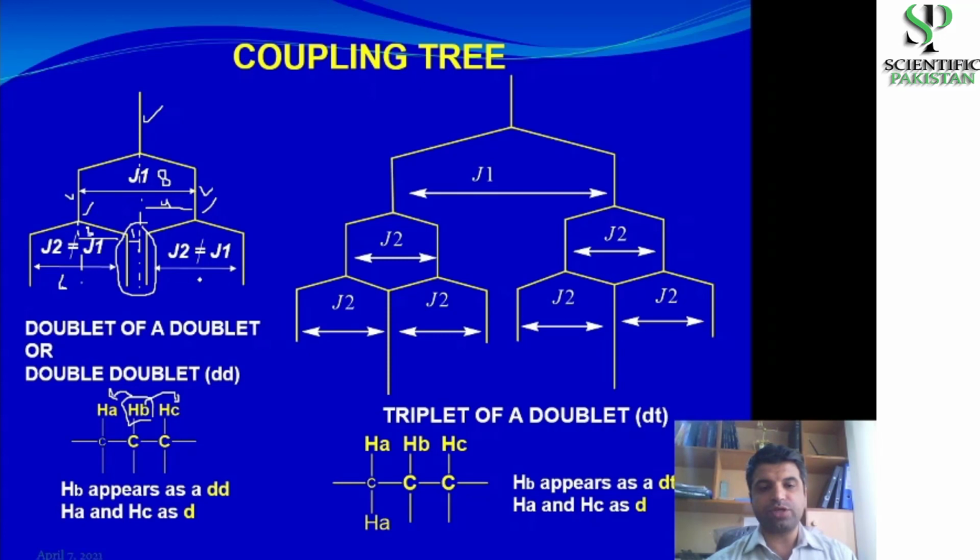Similarly, to have a splitting of 6 hertz here, it has to move from the center by 3 hertz. But to join here at the center, it has to move 4 hertz. And so still we have 1 hertz of gap.